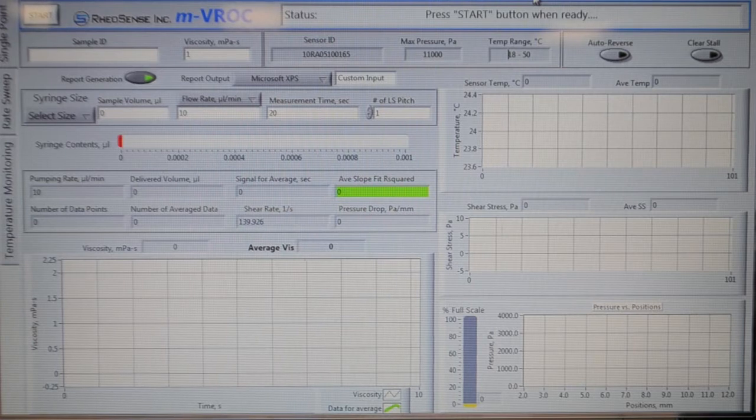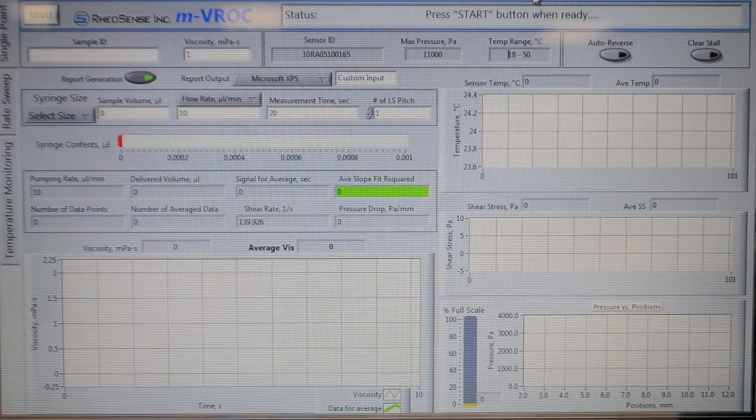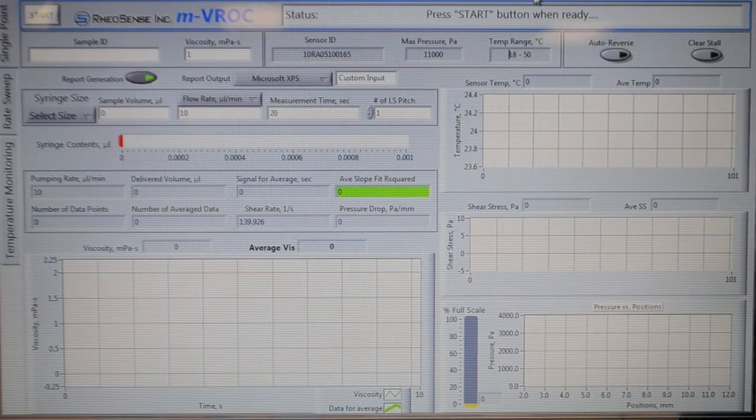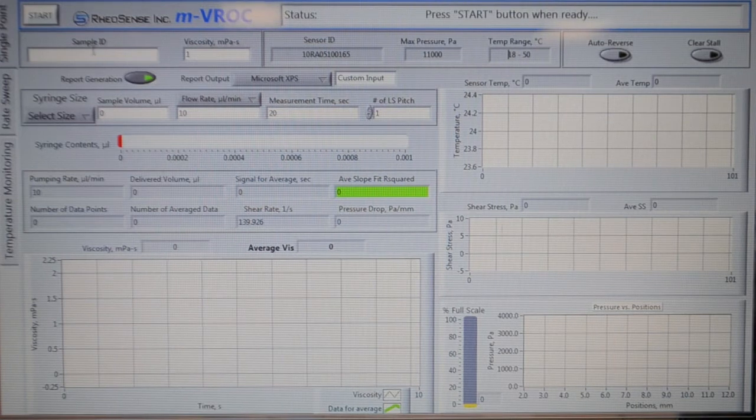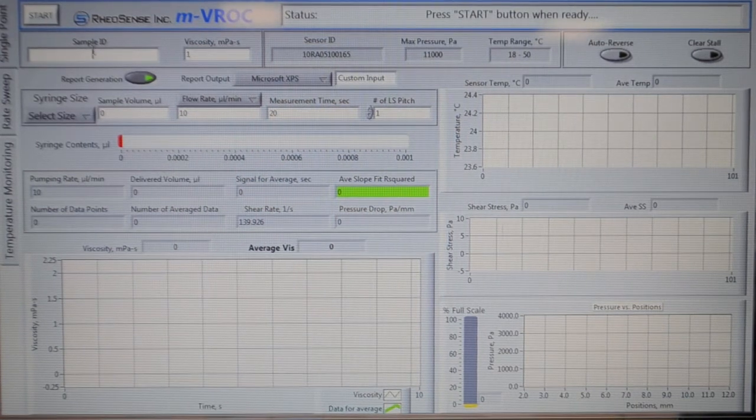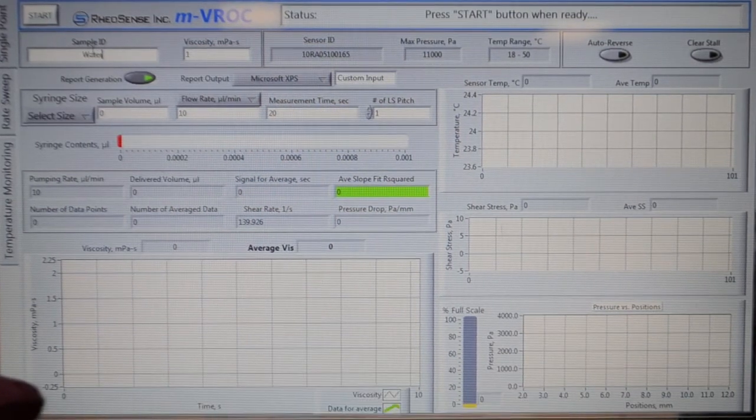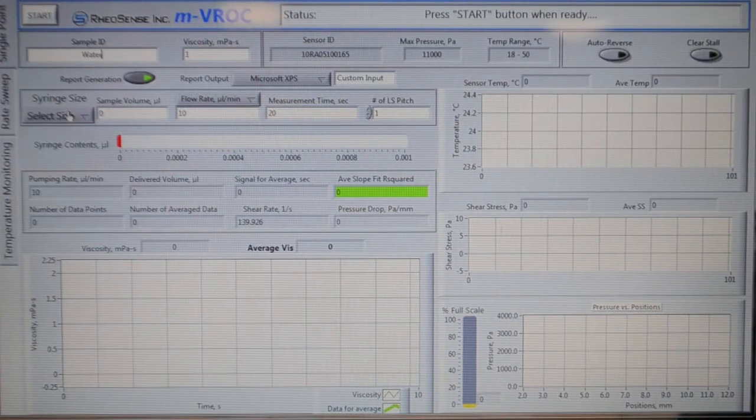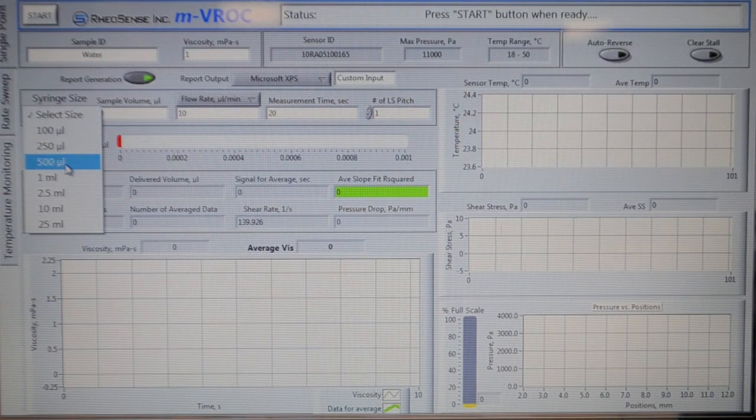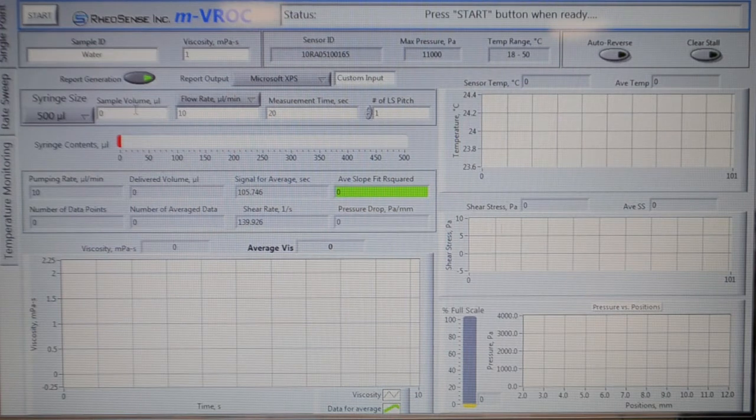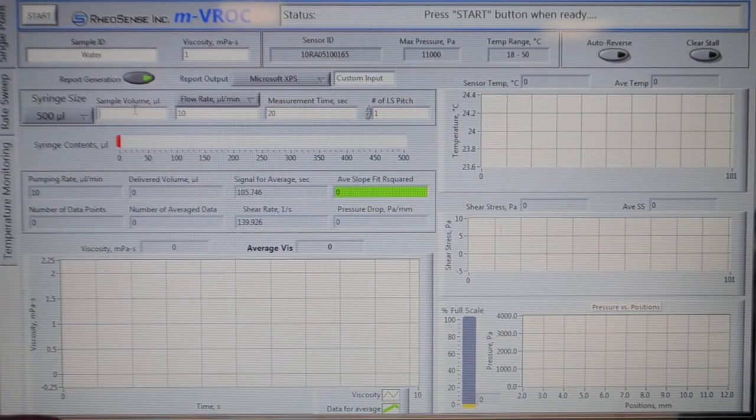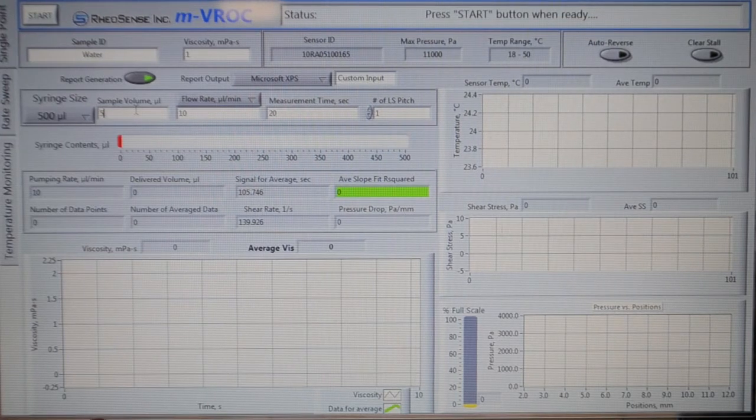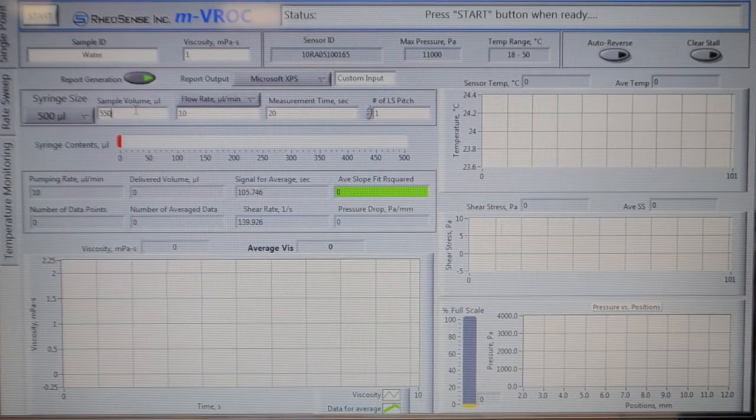But before you do that, first we need to type in the sample ID, select the syringe size, and set the syringe volume. The sample ID would be water, the syringe size would be 500 microliter, and the sample volume, as I remember from before, was around 550 microliter.